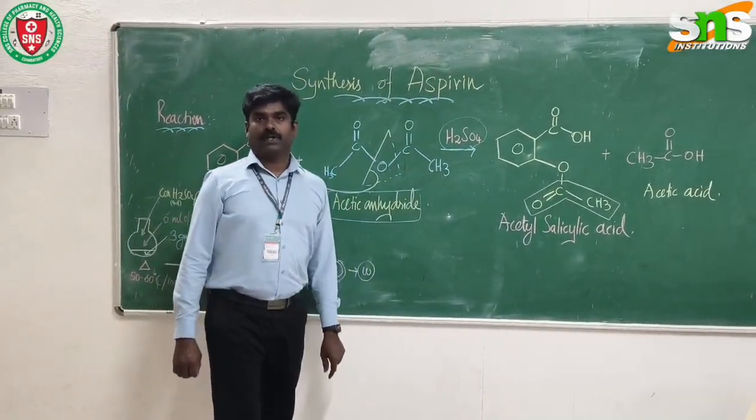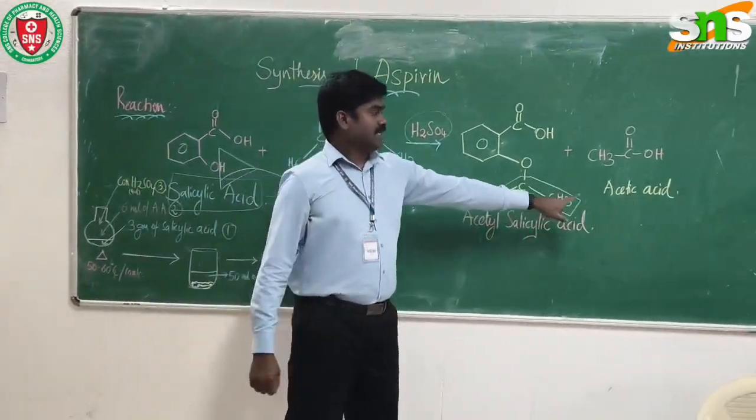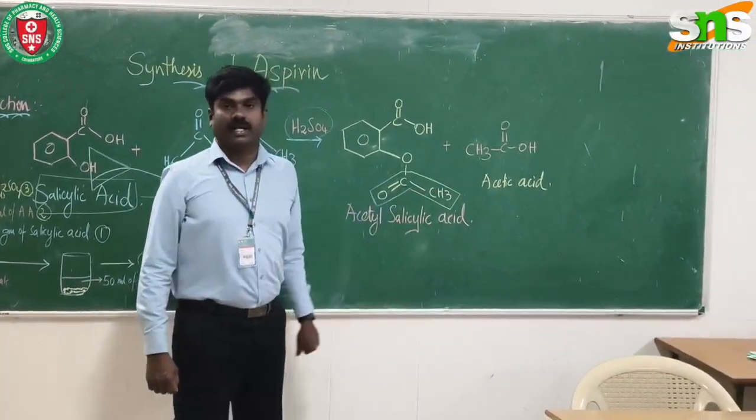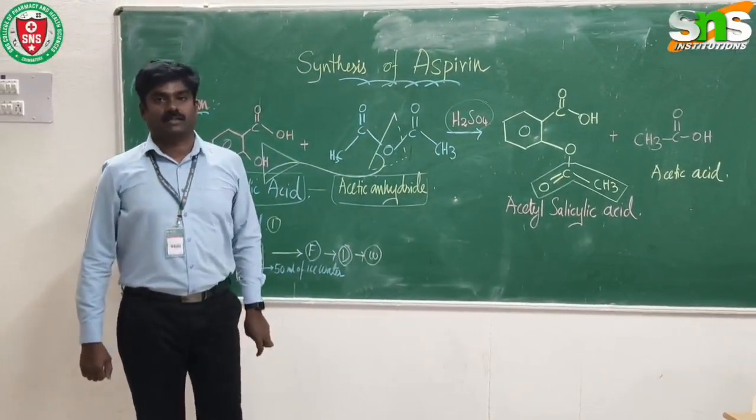With the help of a purification method, we can remove the acetic acid. So finally, we can get the pure product of acetylsalicylic acid.